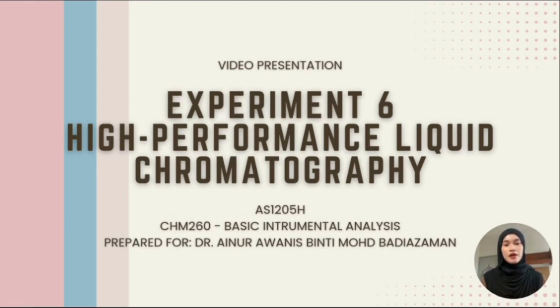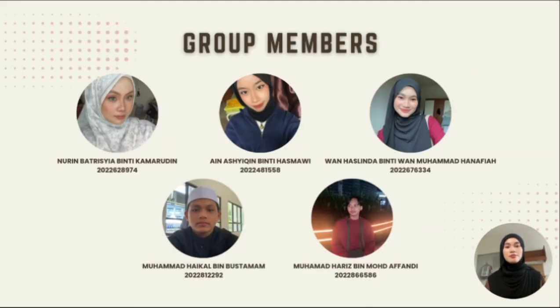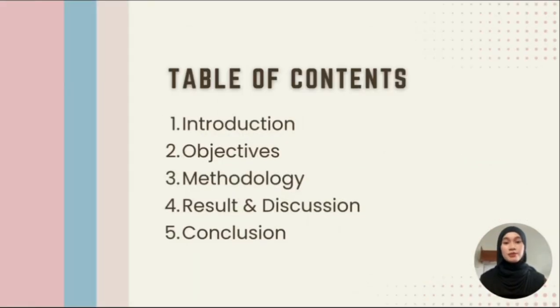For today, we would like to present about experiment 6, which is high performance liquid chromatography, HPLC, in caffeine. Before we start, I would like to introduce first my group mates. So we have Nurin Batrisha, Ain Ashikin, Muhammad Haikal and also Muhammad Haris. In this video presentation, it contains introduction, objective, methodology, result and discussion, and also conclusion.